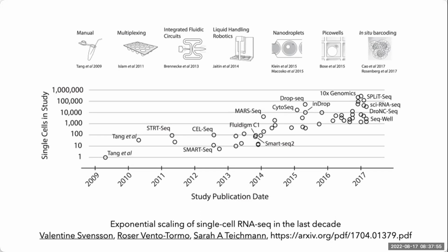And this has given rise to a new cousin, or a new analysis method, which is spatial single cell transcriptomics, which is a very important single cell technology and research field that will help us understand tissue heterogeneity and cell differentiation types.